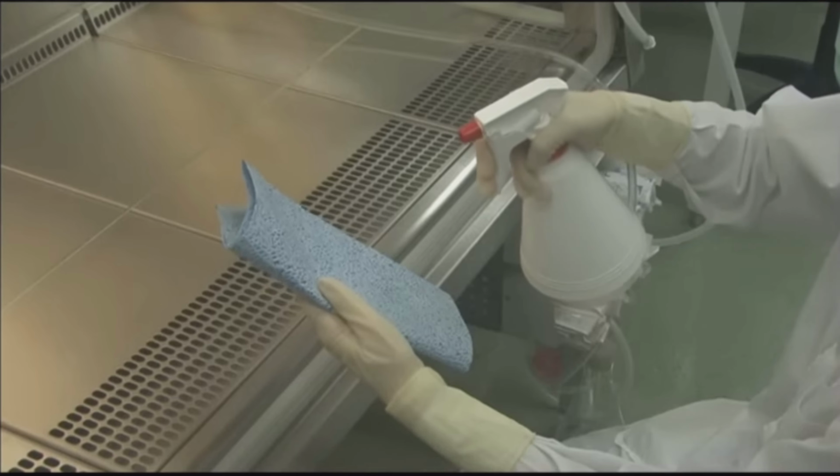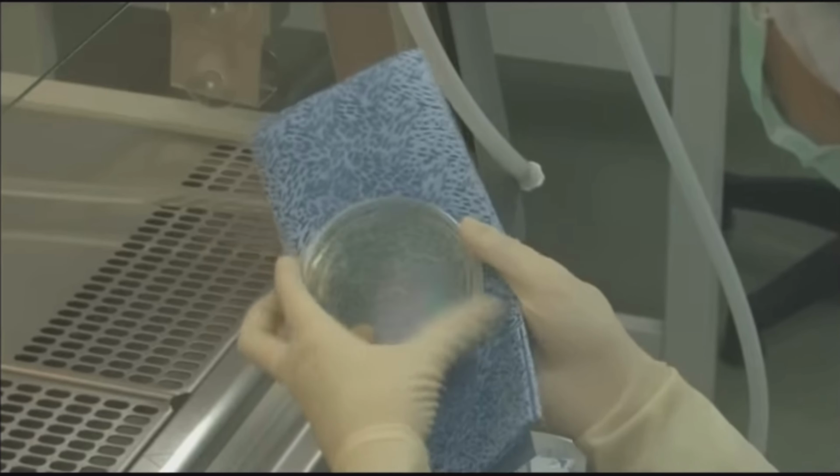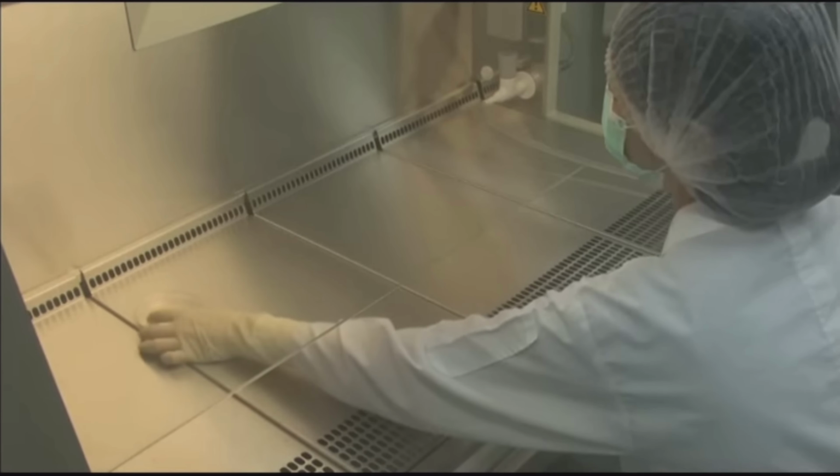Now the time comes where you need to wipe your culture dishes too, and they should be wiped again with 70% ethanol, followed by placing them in the biosafety cabinet.